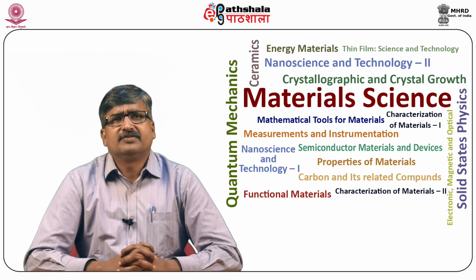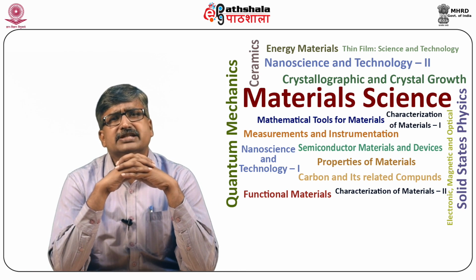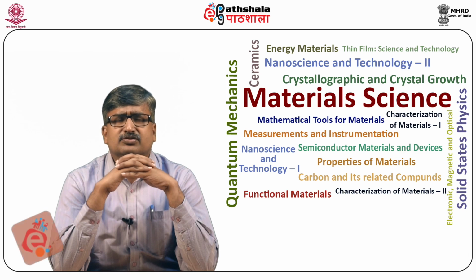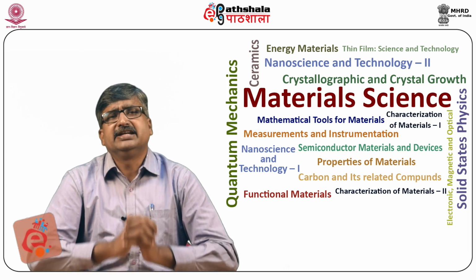The detection of several hundred molecules in CE employing laser-induced fluorescence is possible, and the ultimate goal of detecting a single molecule will probably be attempted in the near future. So this technique is going to give us a very nice separation as well as detection technique in future.